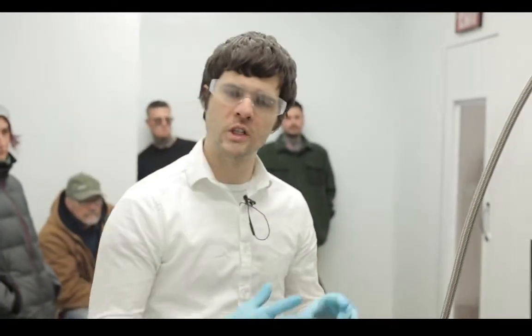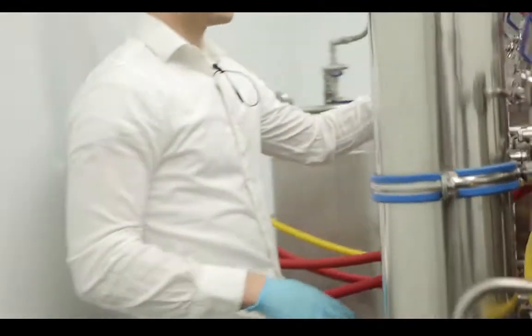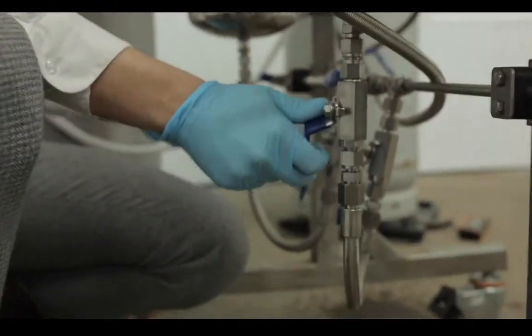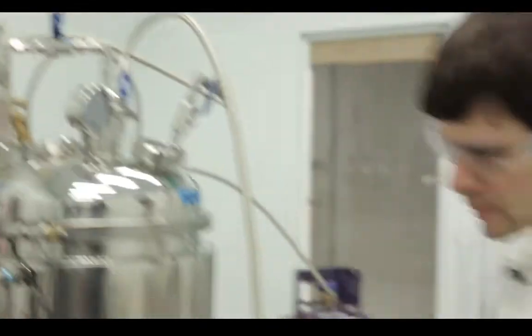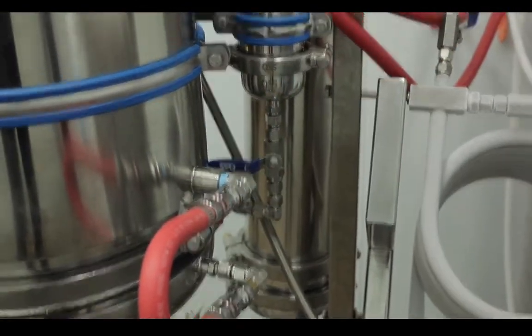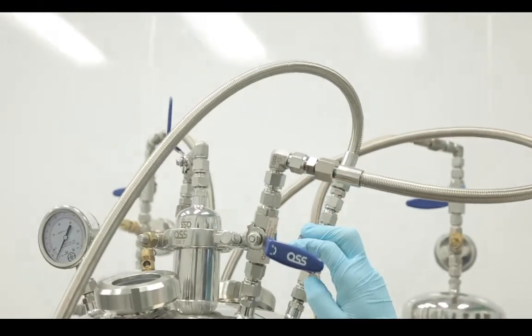So in order to close the vacuum, once we've reached an appropriate vacuum, we're going to go backwards to the front. So from the top of our extraction column, here is already closed. We will close here, close here, here, the bottom. Here, here, closed. To our solvent recovery system. From here, we will follow our red hose from the Haskell pump to the bottom of the sieve. Top of the sieve. Solvent tank closed at the vacuum and then disconnected from the power.